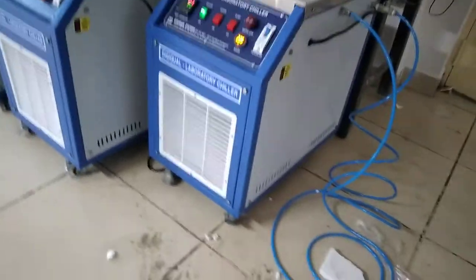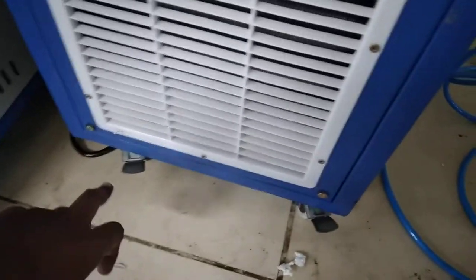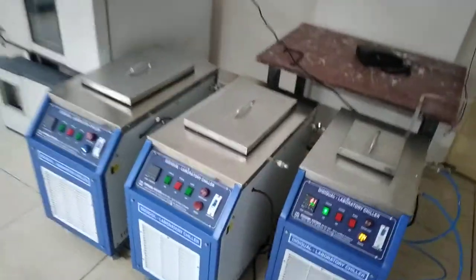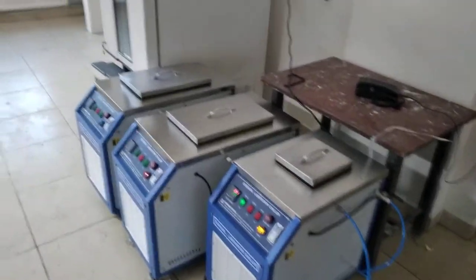It comes with the movable wheels. We have the movable wheels on the floor with locking mechanism. So it will be very easy to move the chiller here and there. You can move the chiller very easily in the lab, anywhere you need.